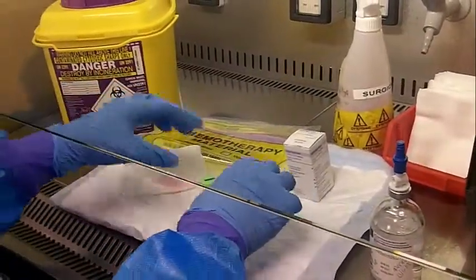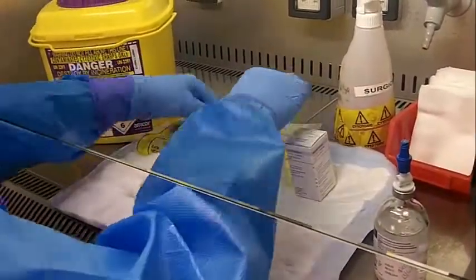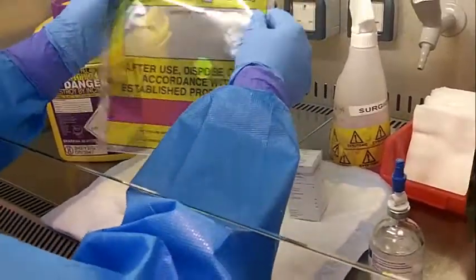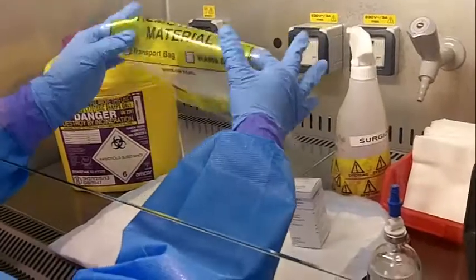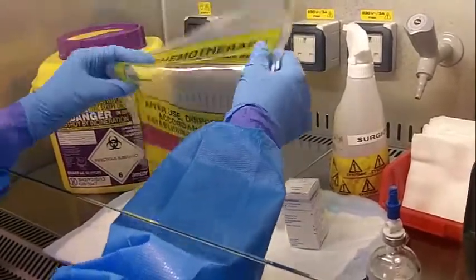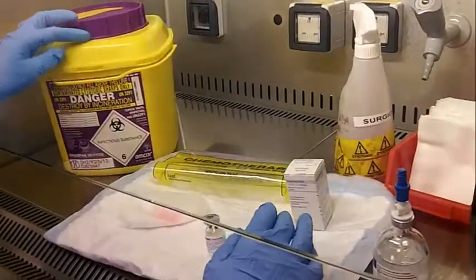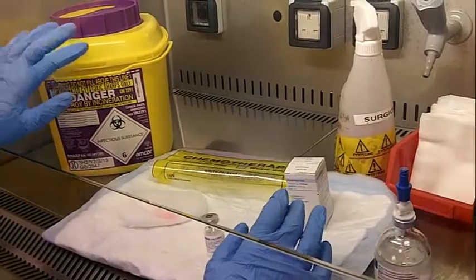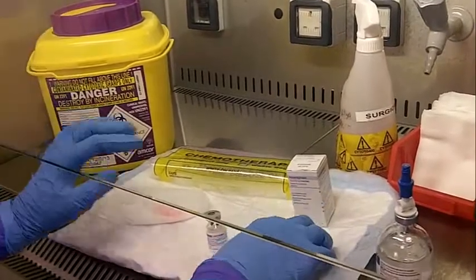Just like that, handy. All our soft waste goes into these little bags, and when the bag's full, we can seal that over, and it just goes out as cytotoxic waste. Any of the sharps waste will go into this cytotoxic sharps bucket here. You know cytotoxic stuff because it's always yellow with the purple.